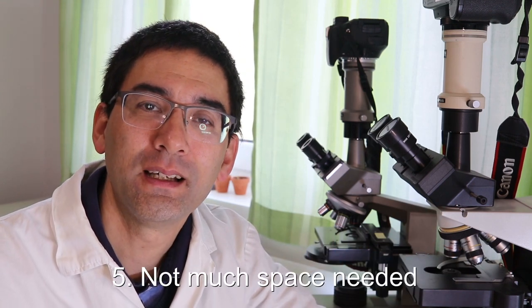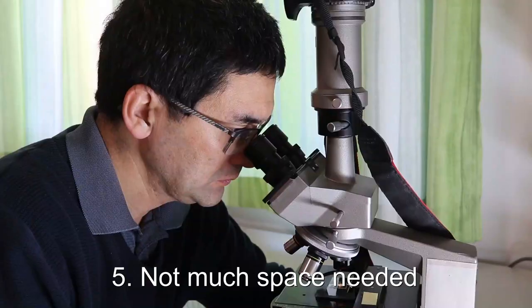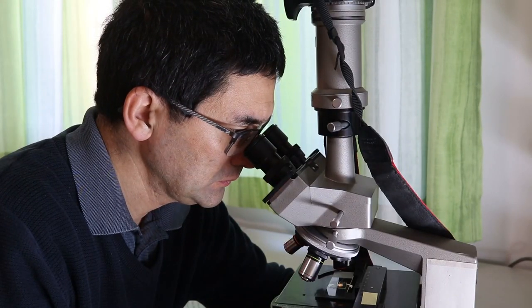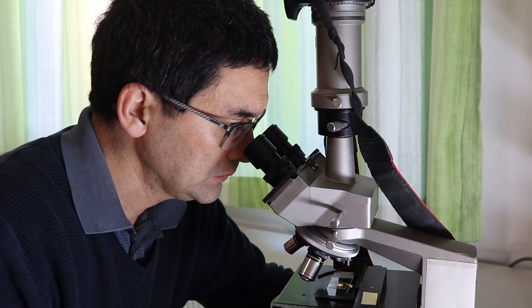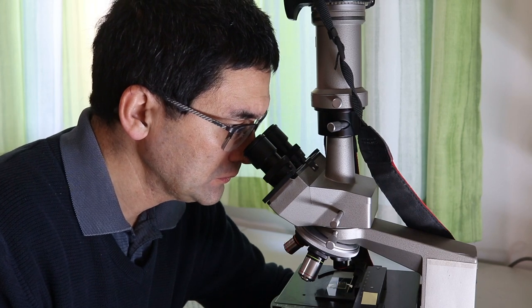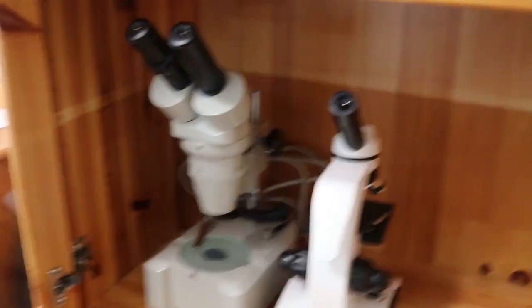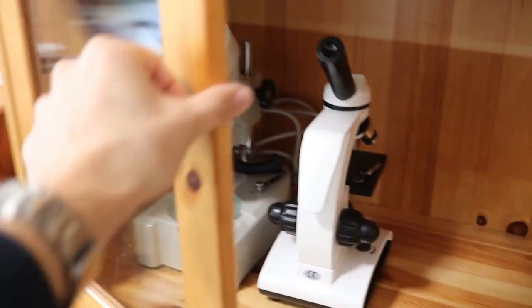Another thing: you don't need a lot of space. You basically set up your microscope on a table and you can start observing. If you do not use the microscope anymore, you just put a dust cover over it or put it into a cupboard so that it doesn't get dusty.